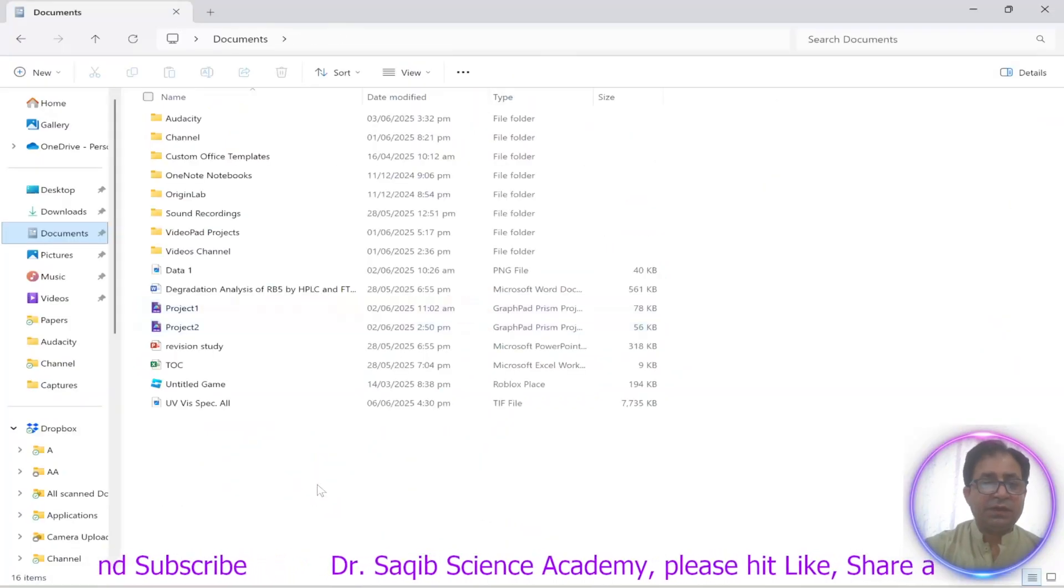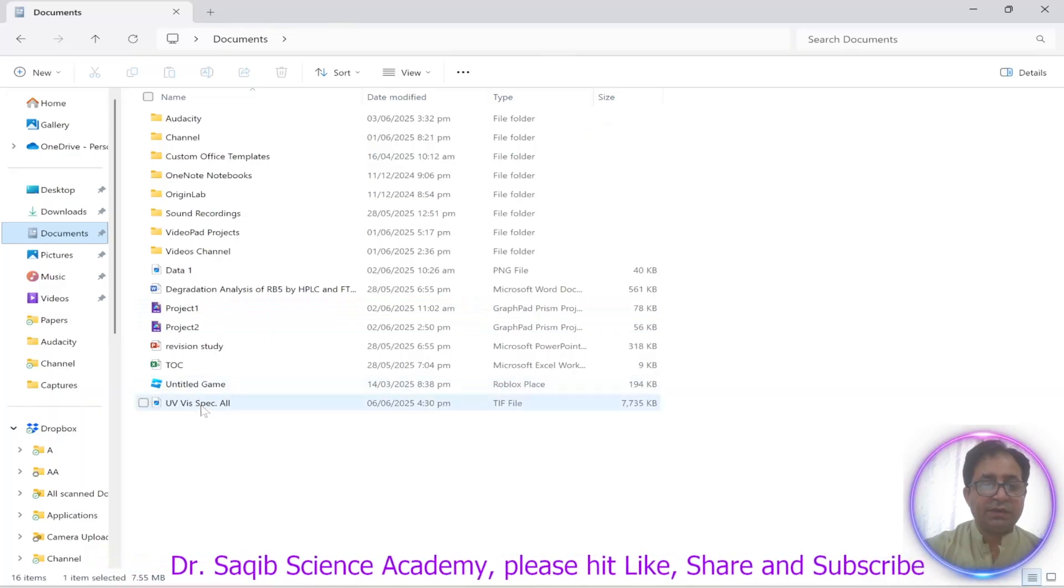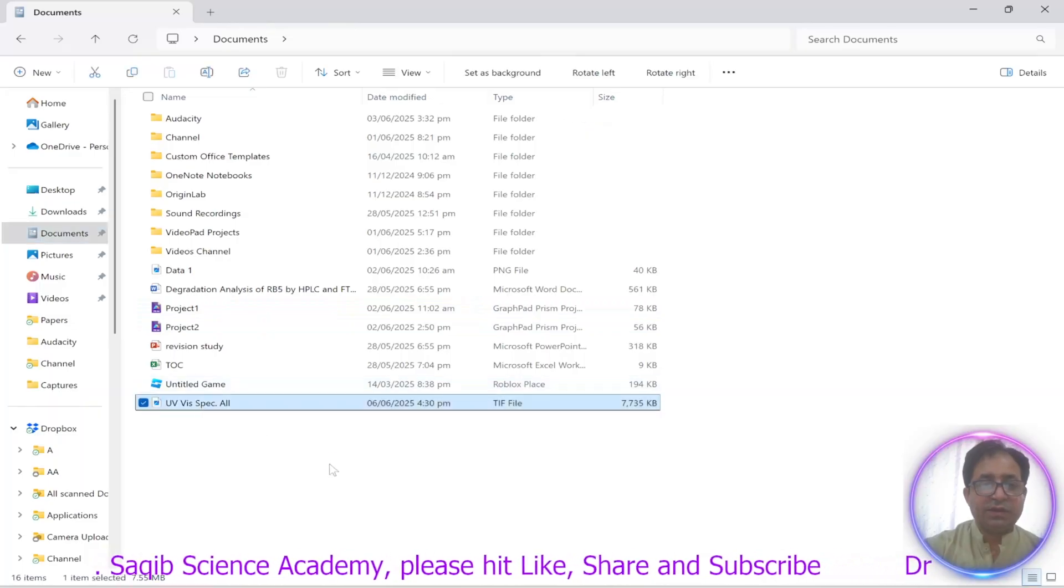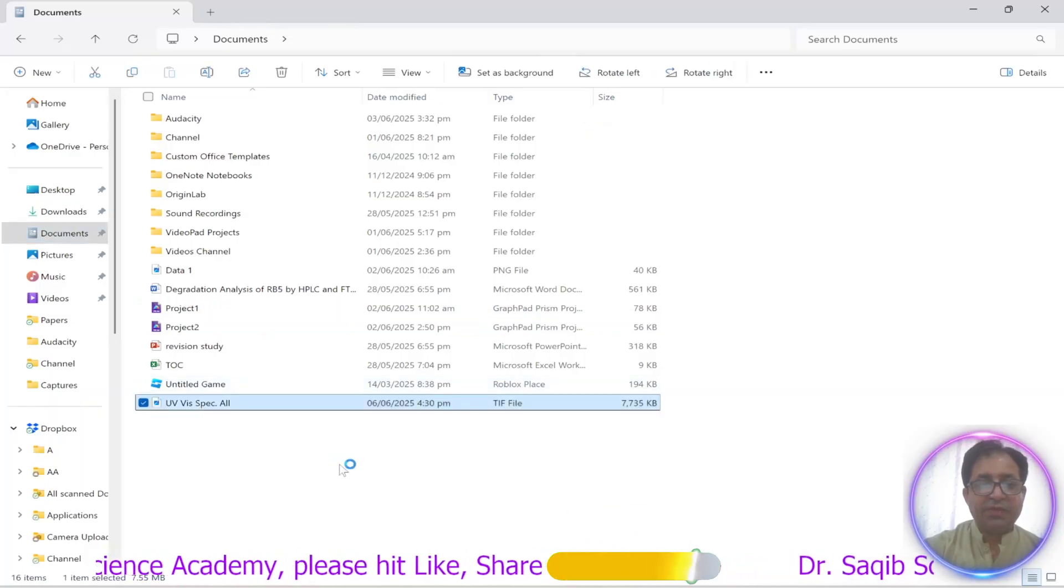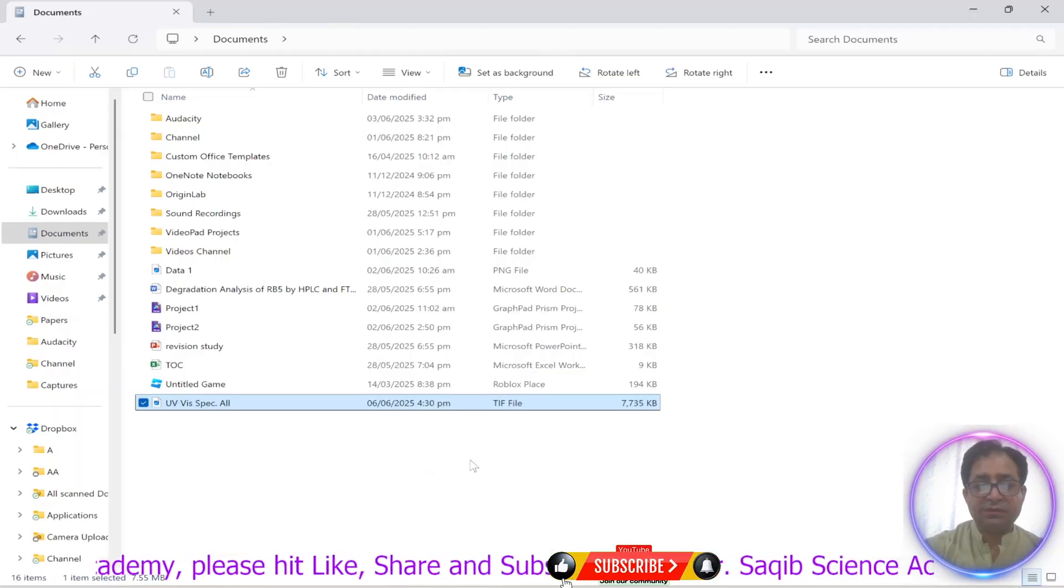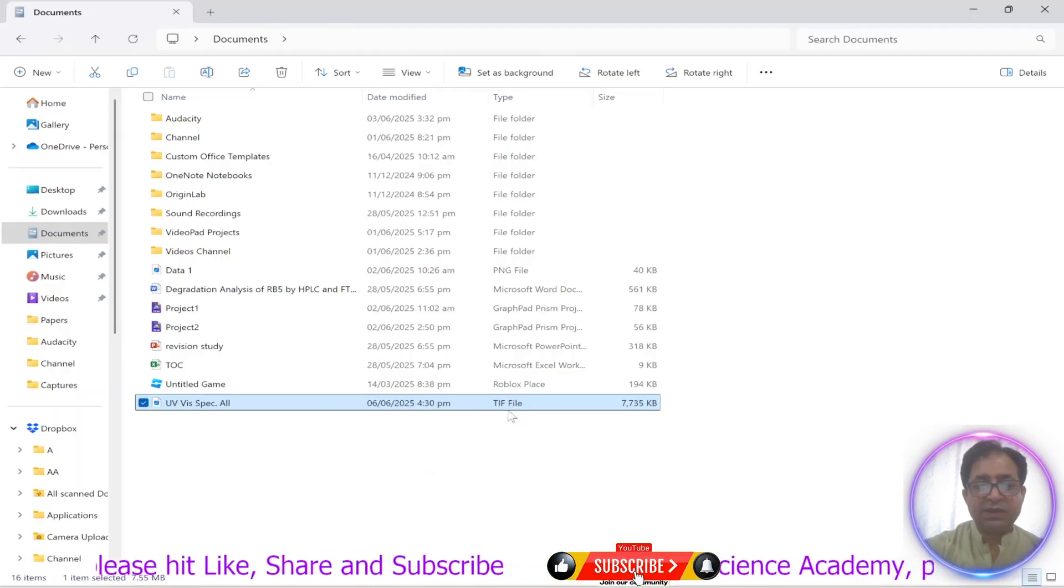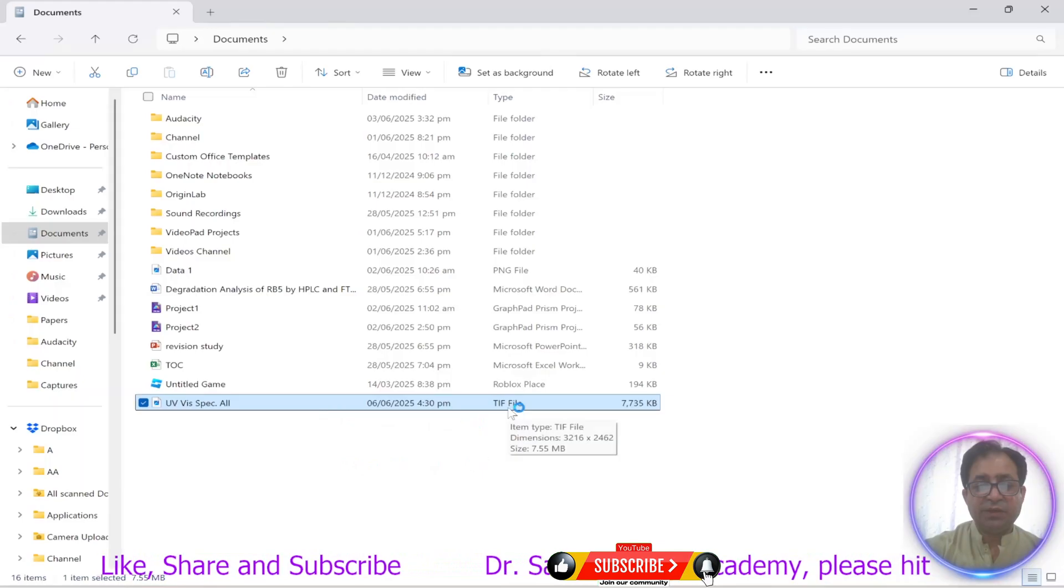Then I'll open my document and you can see over here we have the UV visible spectra as TIF file, so we will open it. So you can see a much better graph, a very good graph.